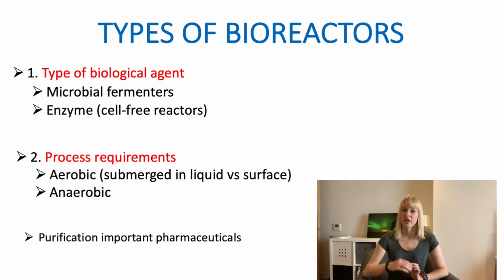So you might need to look at different reactor designs to make sure that the oxygen is appropriately distributed in your reactor. Whereas enzymes are much less sensitive when it comes to shear, so you have a bit more flexibility there. And then the second thing is whether you're working with an aerobic culture, which needs oxygen, or an anaerobic culture, where that's not such a big deal.